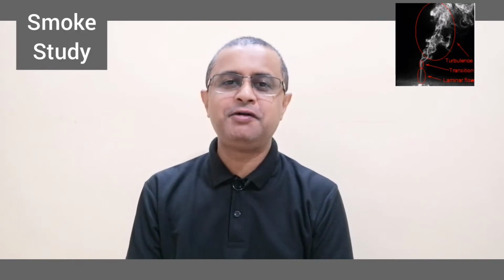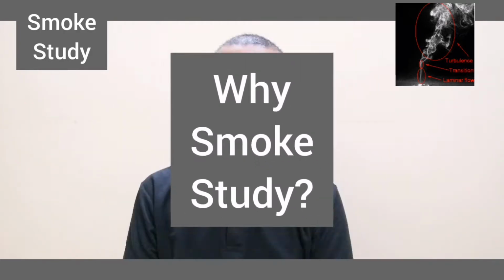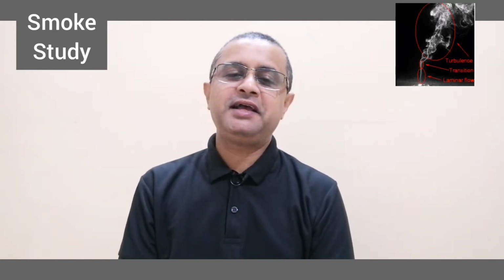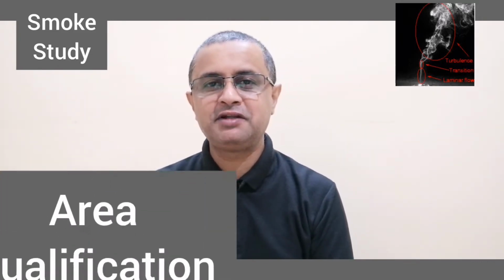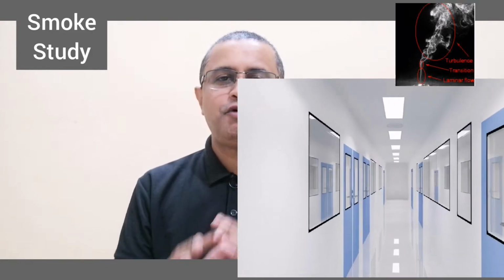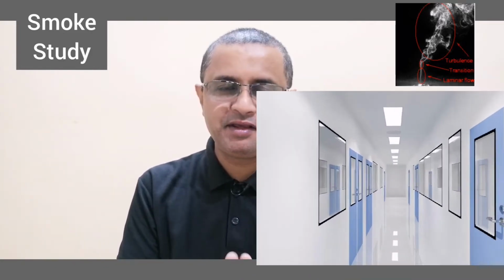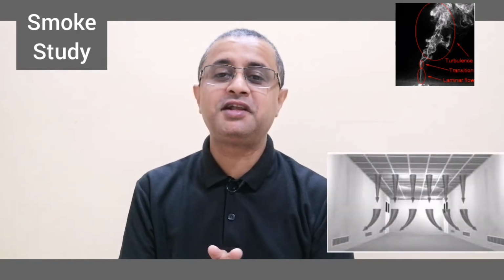So in this specific video about smoke study, I will talk about why we need smoke study for area qualification and equipment qualification. For the area qualification part, when we have designed our area for clean room operations, it can be grade C, it can be grade B, then we have to prove that it is maintaining the required area classification. So we need to first demonstrate the smoke study airflow from the terminal HEPA filters.